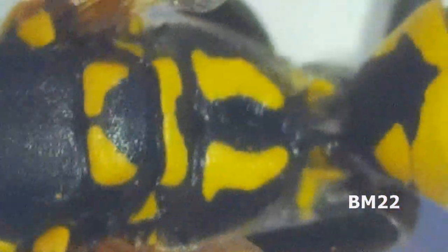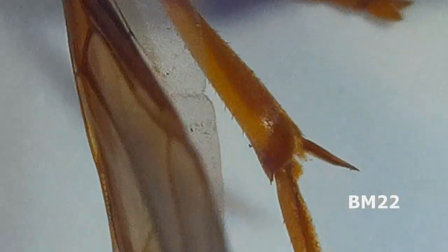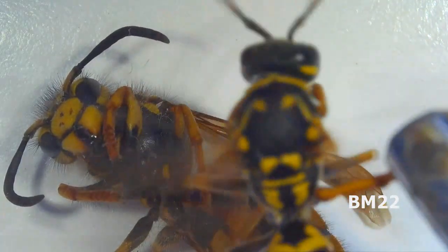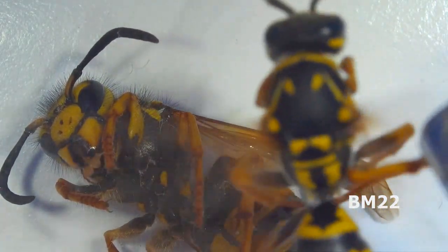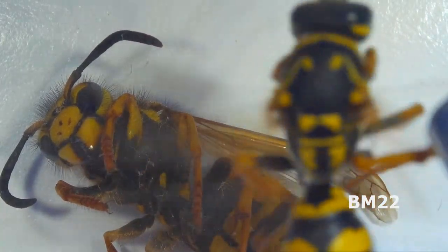Look at these wings. Compare them back and forth and you'll say, wow, these are very different. But if you've just seen them flying, you wouldn't think there was any difference at all in these wings — at least I didn't. But as you know, that's the beauty of magnification and our video microscope.